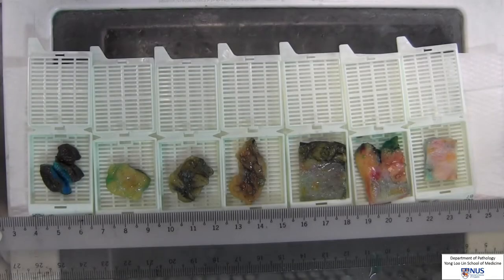These slices, together with lymph nodes from the axillary tail, will be sent for processing to be evaluated microscopically for staging and grading purposes, which we will discuss in part 2 of this video.